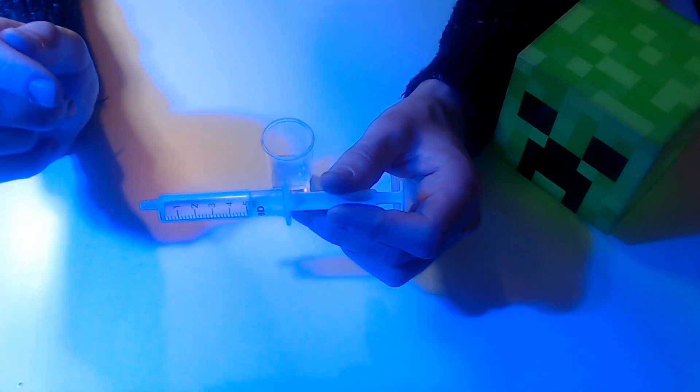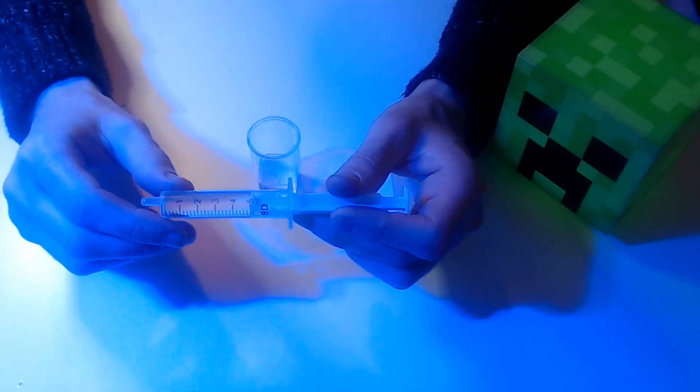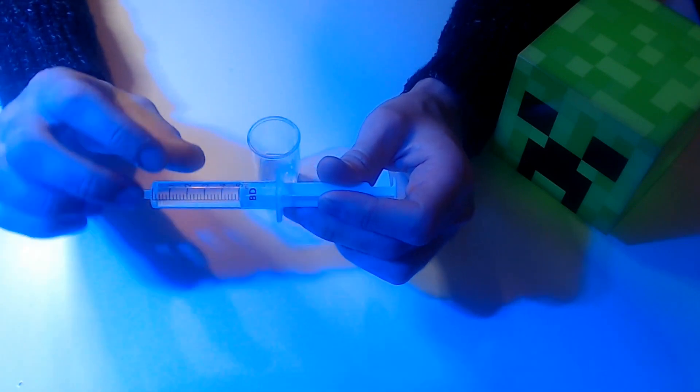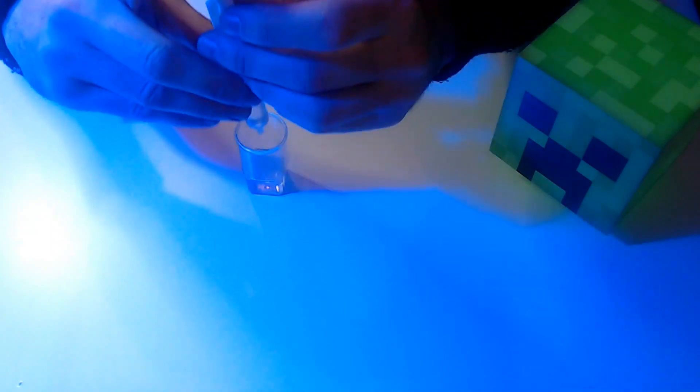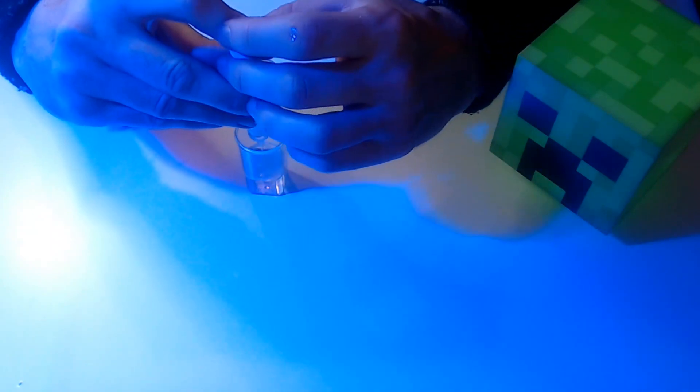First step, very simple: you want to add 10 mils into your water beacon here. Your water syringe only goes up to 5, so you need to do this twice. I've already put 5 mil in, the other 5 in.